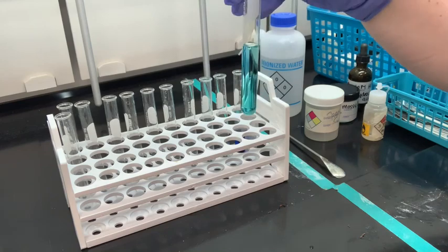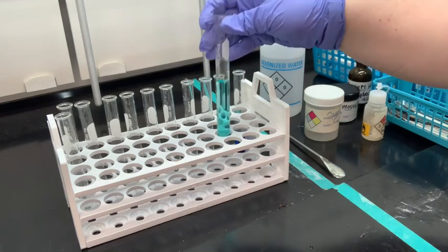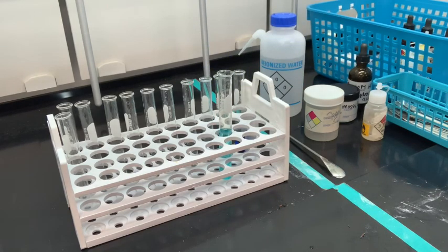But this solution is light blue. It's going to be under the water-soluble solids. That's going to be our product. All those water-soluble solids are aqueous. That's their physical state. And it looks like there's only one that's blue, so you should be able to identify what is in our test tube here.